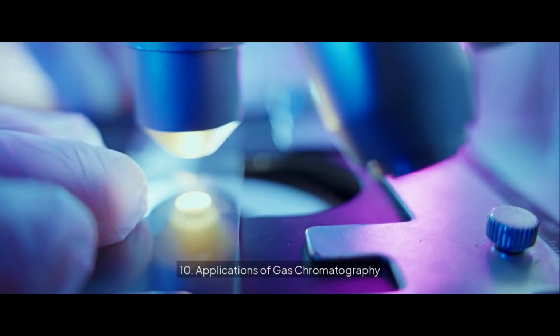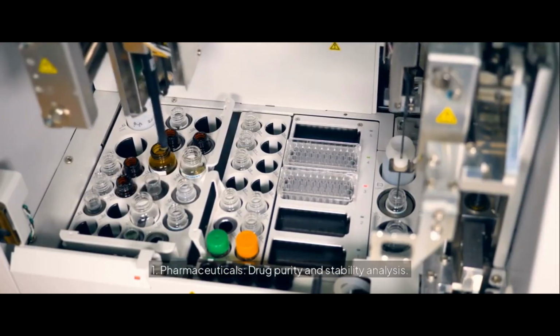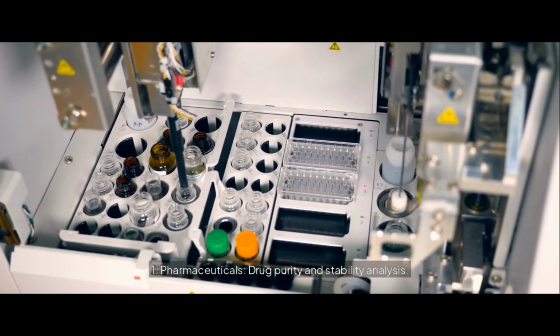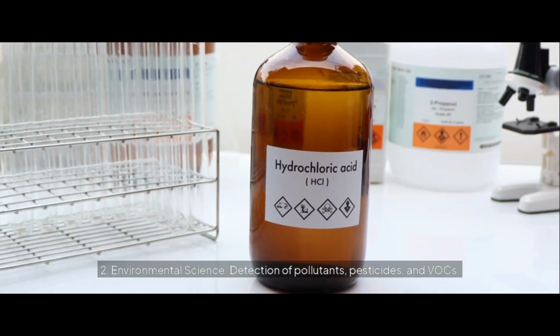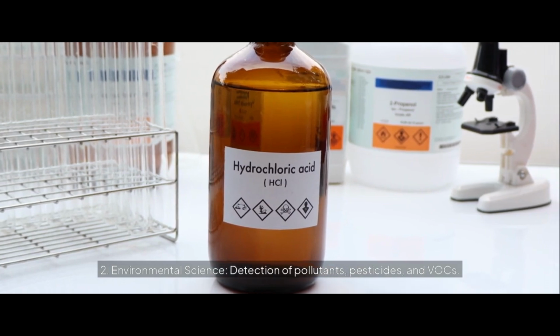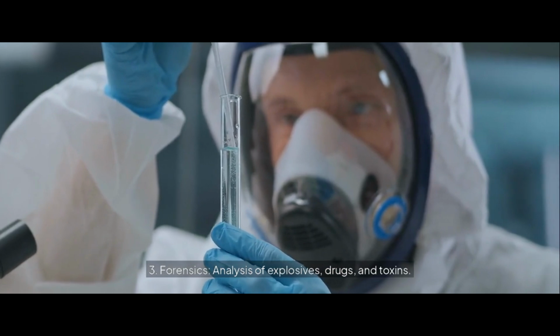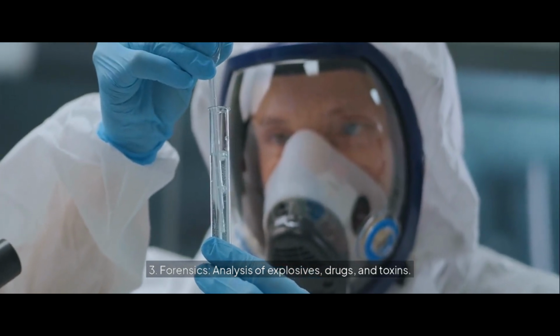10. Applications of gas chromatography. 1. Pharmaceuticals, drug purity and stability analysis. 2. Environmental science, detection of pollutants, pesticides, and VOCs. 3. Forensics, analysis of explosives, drugs, and toxins.